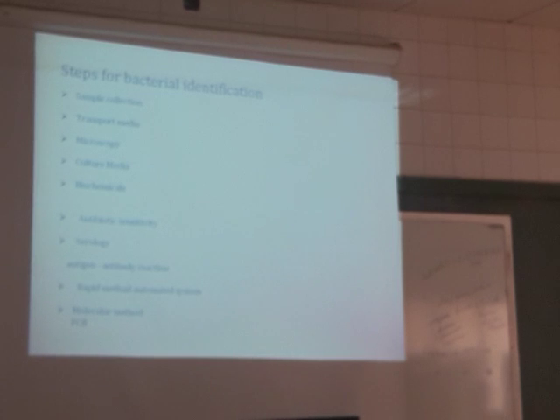For example, patient person A is having a urinary tract infection. The doctor wrote an antibiotic sensitivity test, and when the patient sends his sample to the laboratory, in the laboratory they culture it. They found the microbes. They put the microbe here, and after the growth, they bring various types of antibiotics.